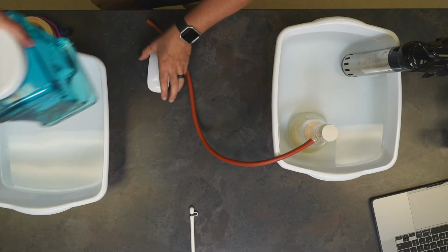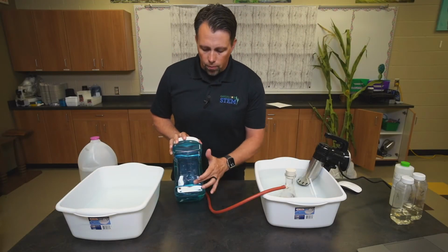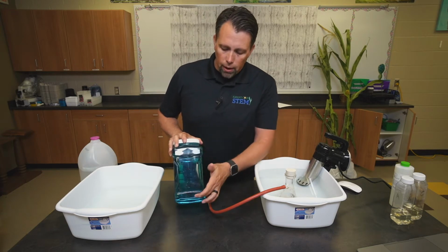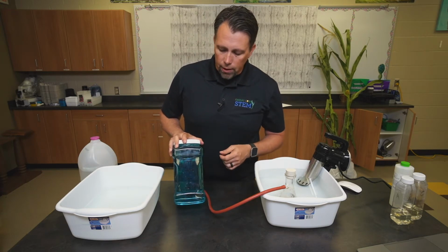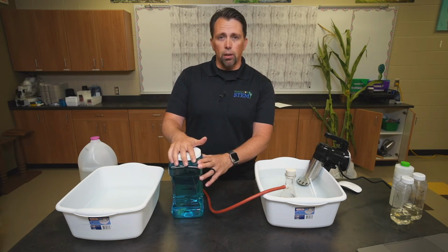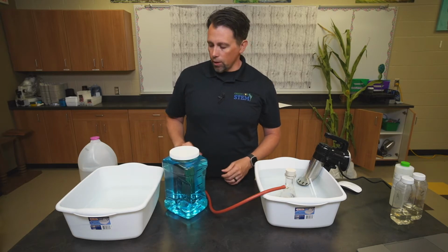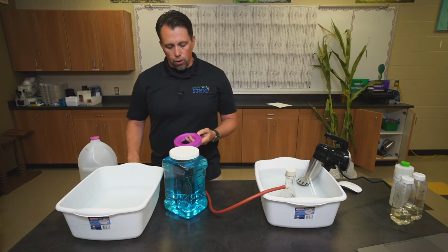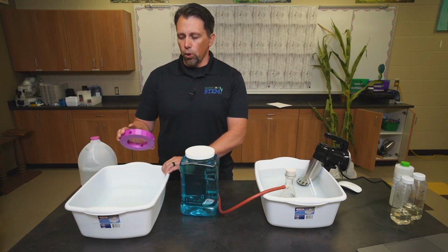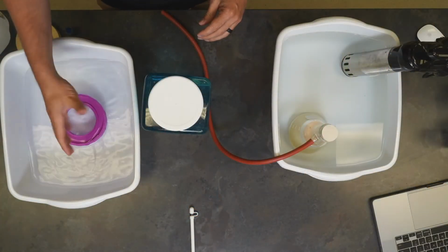So for the gas collection, these 1 gallon jugs, I've filled it with 500 milliliters of water and marked each level. So each one of these marks represents a half a liter. I just filled it with water, put some blue food coloring in it to make it more visible, and put the lid on it. That makes it a little easier to flip over into the container. This is the little 3D printed piece that holds the tubing and keeps it up off the bottom.